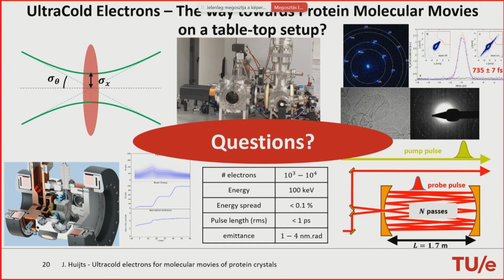Yeah, because at microED they use a commercial electron microscope, and that means that you have basically a continuous stream of single electrons, and that builds up your image. To do something time resolved with a high temporal resolution, you need pulses. And so the strategy that we take is that we take pulses with thousands or tens of thousands of electrons in them, and then you do pump-probe like in an X-FEL. Okay. So in the normal microED, you cannot get time resolved information. Yeah, sure. Okay, thanks.